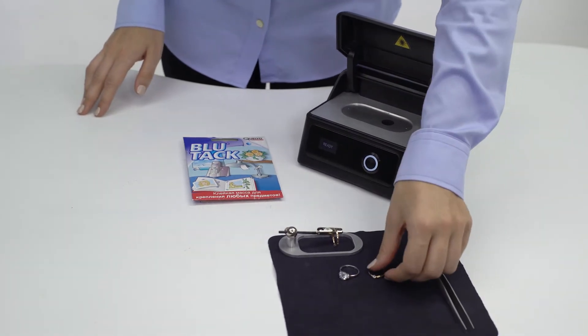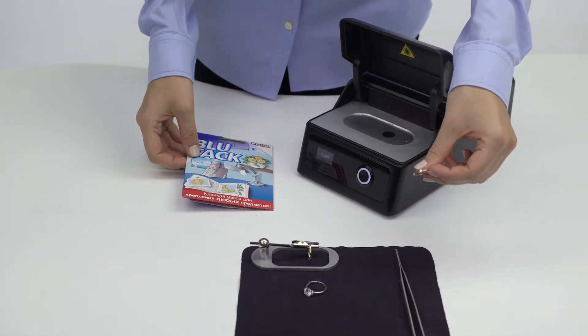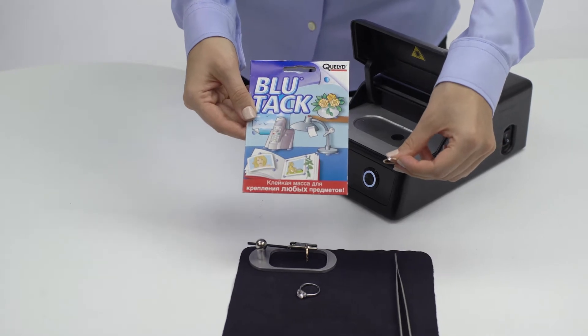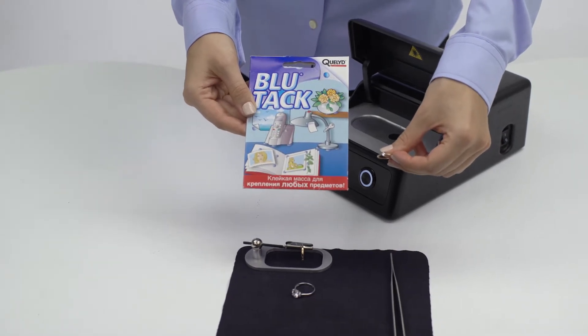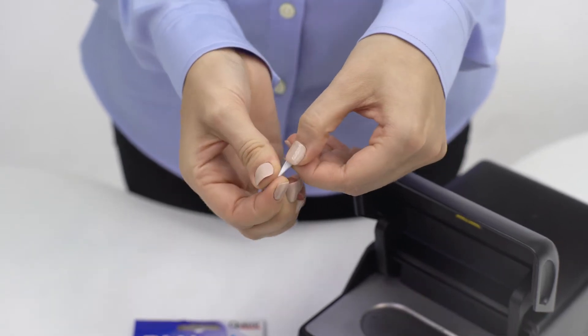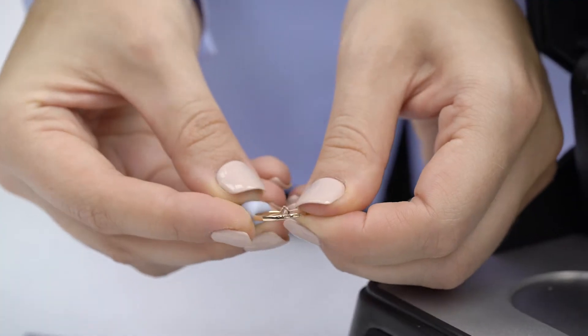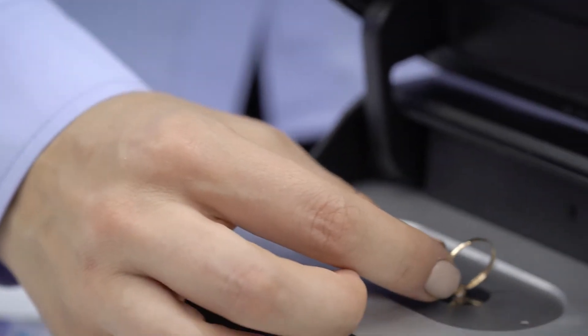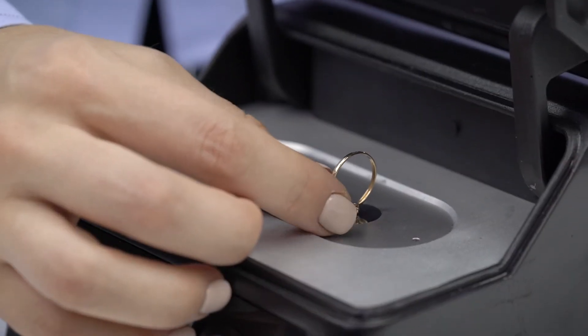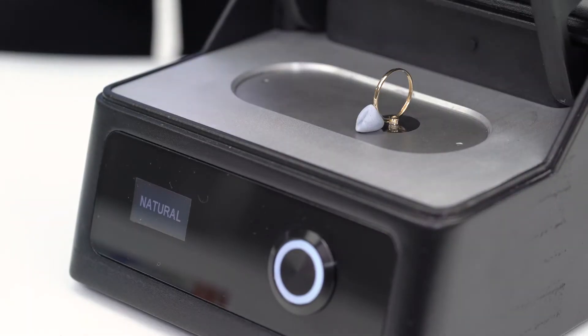If you want to fix an unsteady piece of jewelry and the mechanic holder is not convenient, you can use blue tack. It is similar to play-doh but greaseless, so it doesn't leave any marks on hands or jewelry. Let's put the ring into the device and fix it in the right position using blue tack. The measurement result is 'natural.'